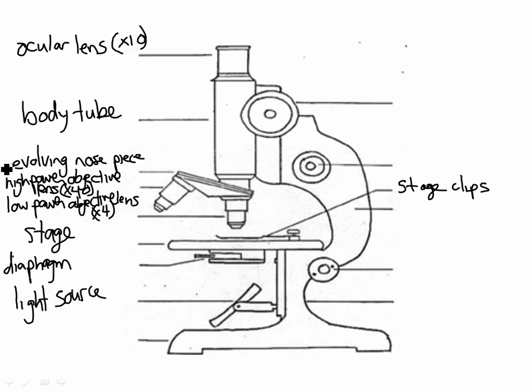What I've done in the past is I've had students take their phones, turn on that bright flashlight, and put it down there. That's great, but it produces lots of light. It can be too bright, so you need to adjust the diaphragm so it's nice and small so it restricts the amount of light that comes in. You can probably see the diaphragm on this one. It's just made up of different sized circles, which prevents the light from getting through. Sometimes that's still too bright, so I get students to take a tissue and put it over top of their phone, and that dulls the light some more.